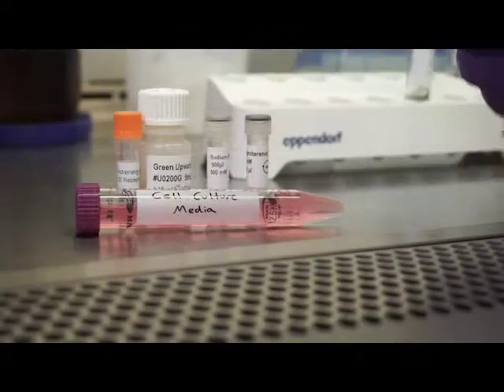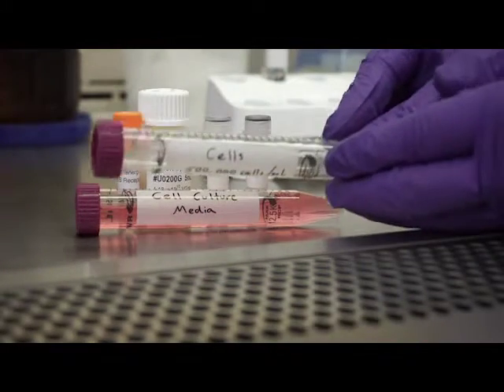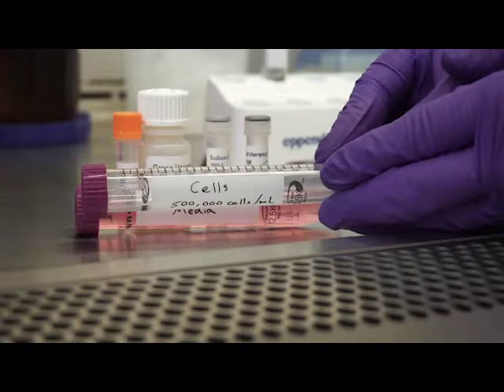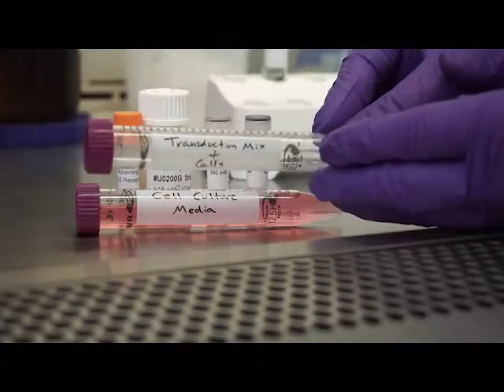Next, we will trypsinize and prepare the cells, leaving them in suspension at the proper density. Finally, we will mix the transduction mix with the cells and plate the solution in a cell culture dish or microplate.